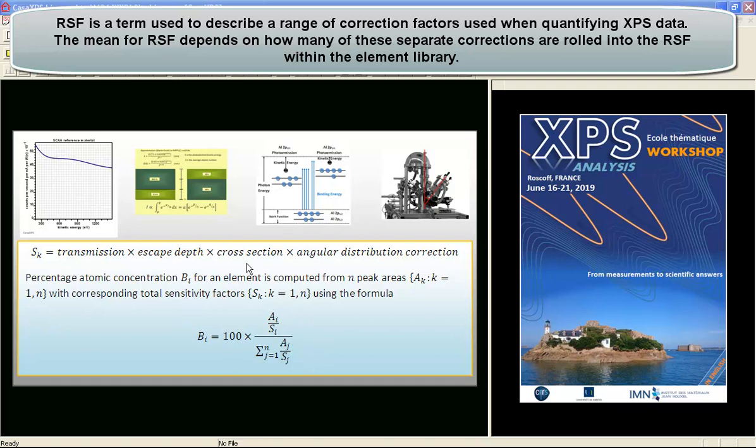There is an alternative to using Schofield cross sections, which is to provide sensitivity factors that are empirically determined from standard materials. If you know the transmission function and the angle for the X-ray source to the analyzer for the instrument that measured the standard materials, you can remove these from the sensitivity factors. In general, empirical sensitivity factors will include the escape depth correction and the photoionization cross section. This means we have the potential for tabulating relative sensitivity factors.